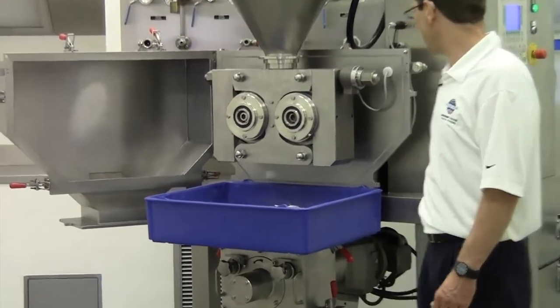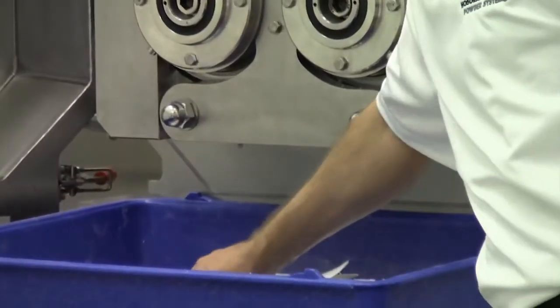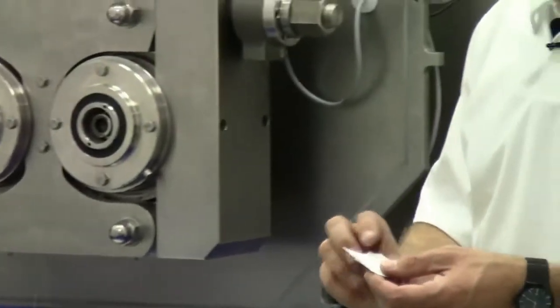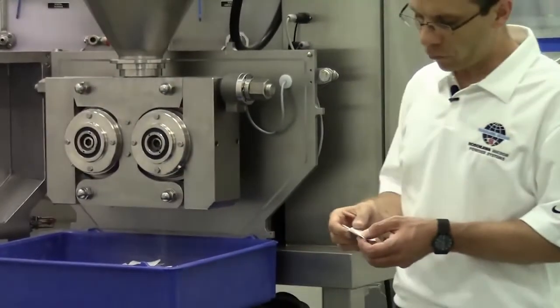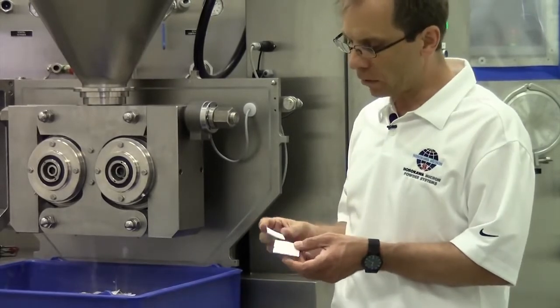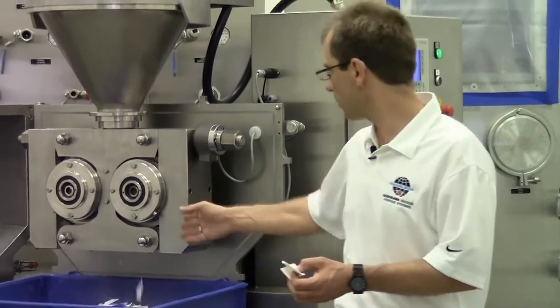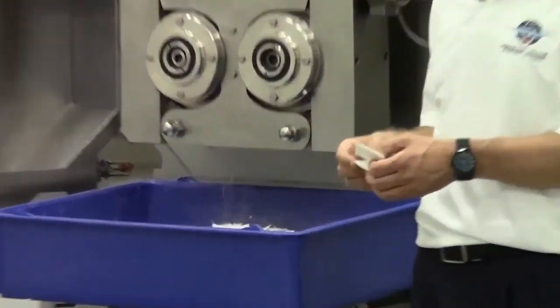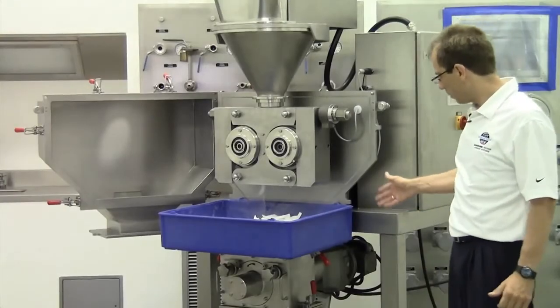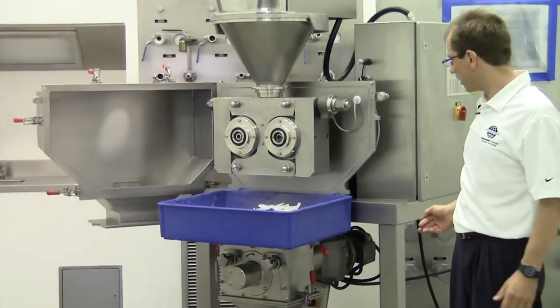What we are producing now are the flakes. We have separated the machine from the flake crusher for demonstration — it's easier to see the flakes. What you see here is compressed lactose. The lactose comes out of the machine and will be crushed in the flake crusher. For demonstration purpose I would like to show you now also the crushing of the flakes.